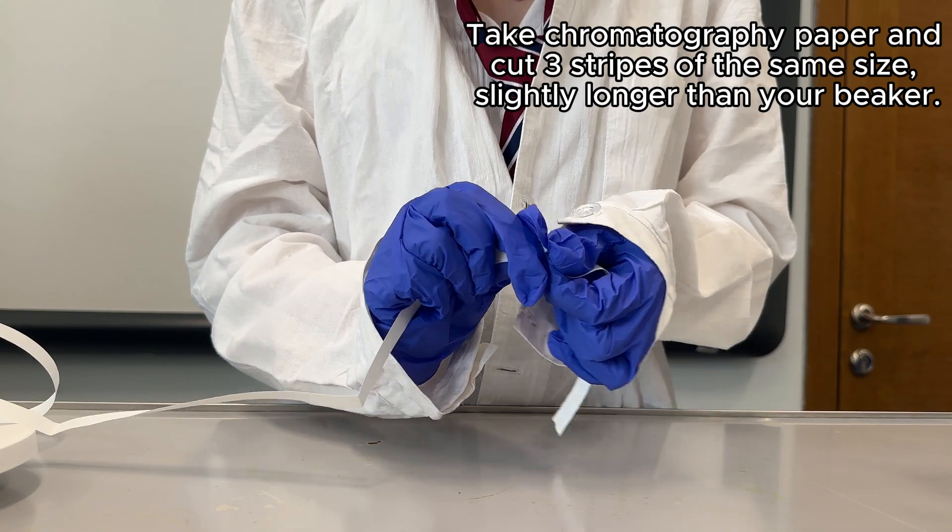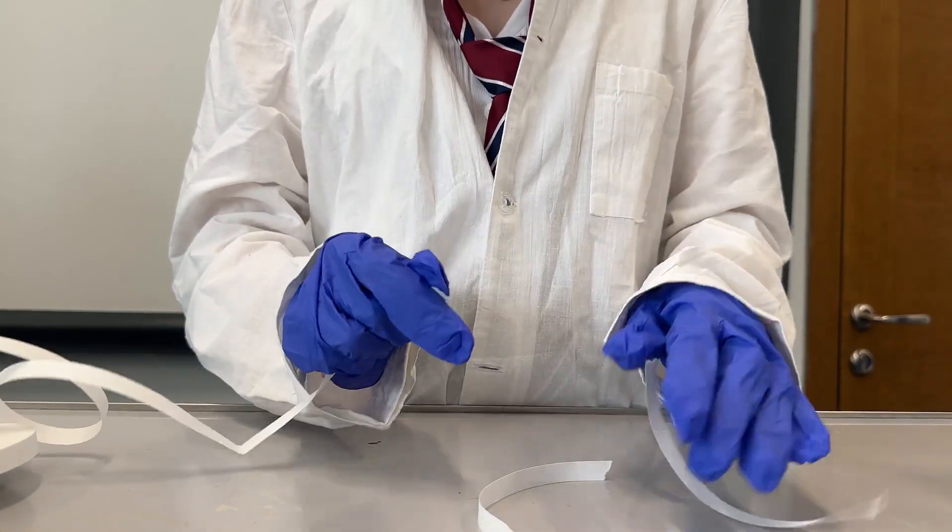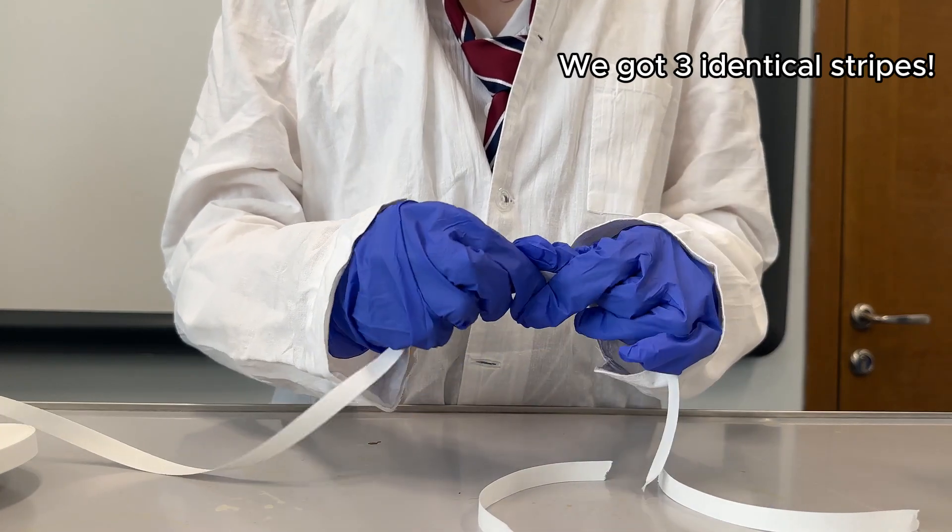Take chromatography paper and cut three strips of the same size slightly longer than your beaker. We got three identical strips.